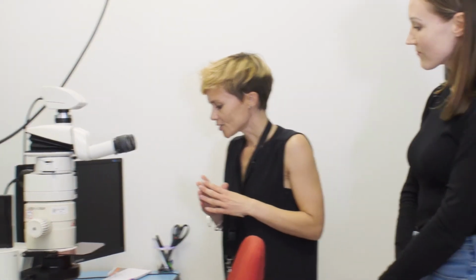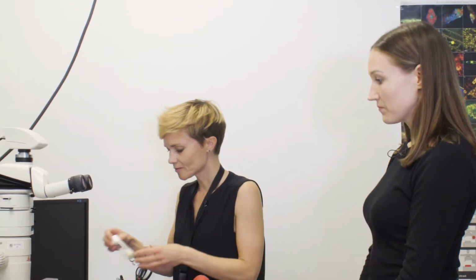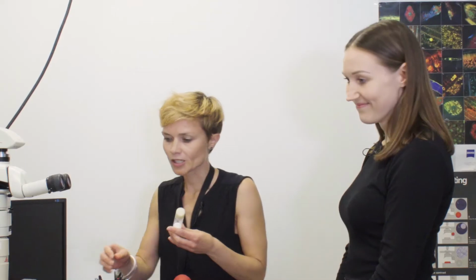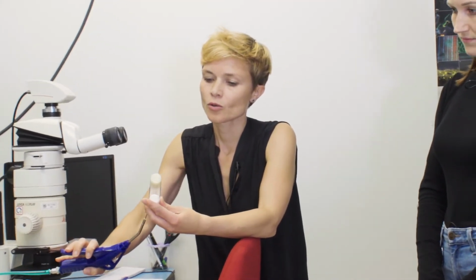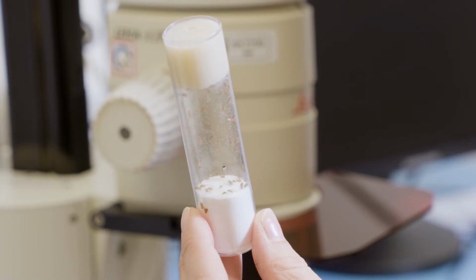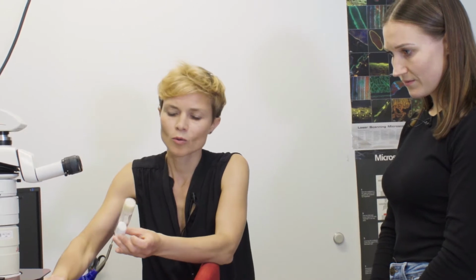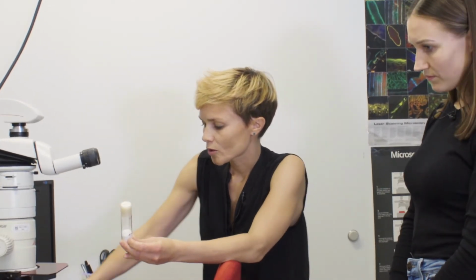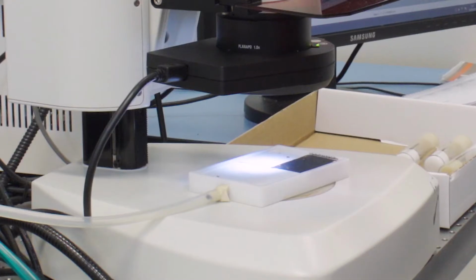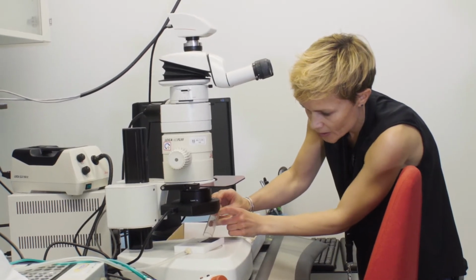One of the things that we always need to do is to put them to sleep. As you know, flies fly, and so we actually just use CO2 to put them to sleep, and it happens really fast. Wow. There we go. And you can see that they all fall at the bottom of the vial. And then I've also got CO2 coming into this little platform here, so they won't wake up and start flying around in the lab.